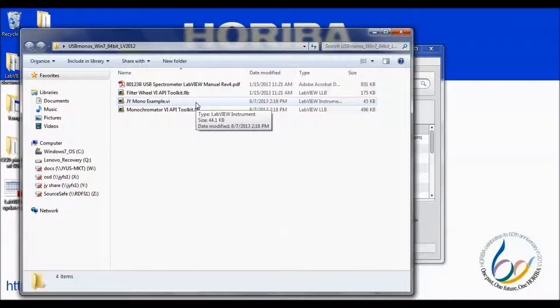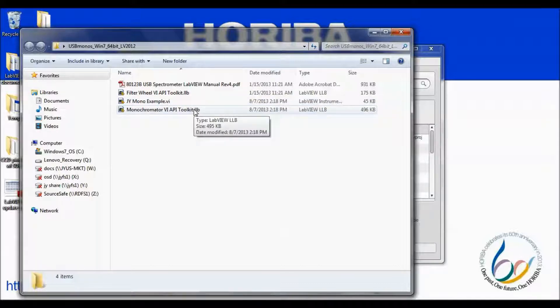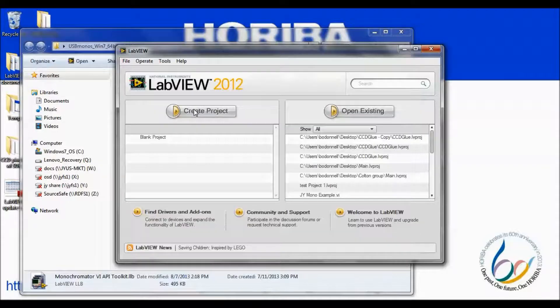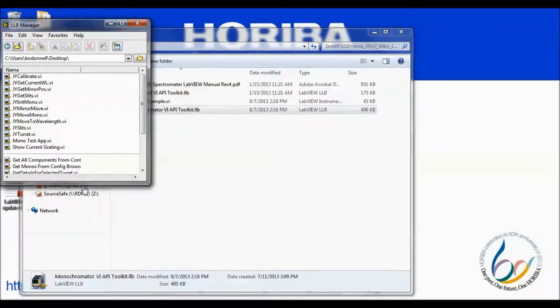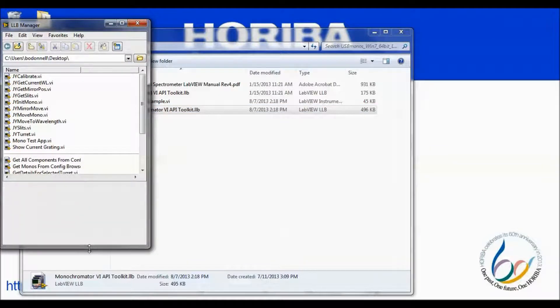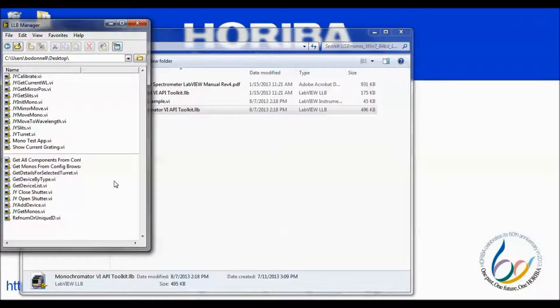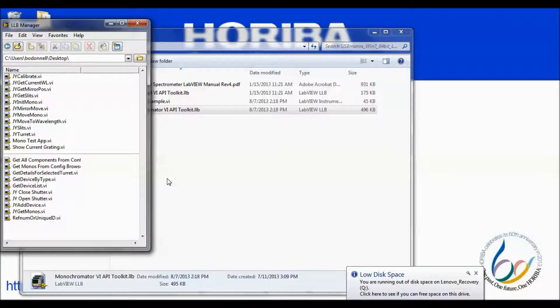It controls the slits, swing mirrors, turret, and wavelength. Finally, we have the Spectrometer Toolkit. This library contains all of the sub-VIs that will be needed to develop any kind of code. If we open this library, we can see a variety of sub-VIs for reading parameters from the spectrometer and setting slit widths, mirror positions, turret position, and wavelength position. These sub-VIs represent the very basic building blocks from which more complex code may be developed.